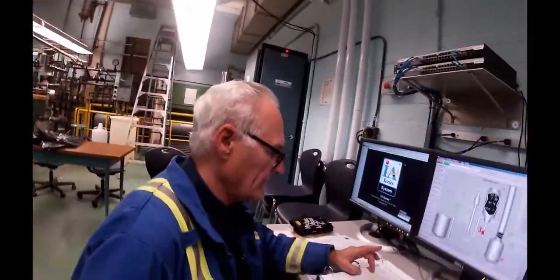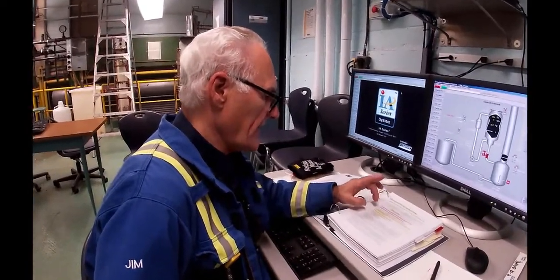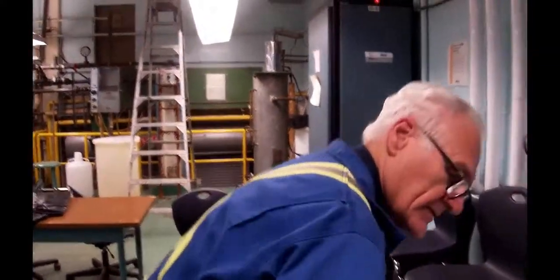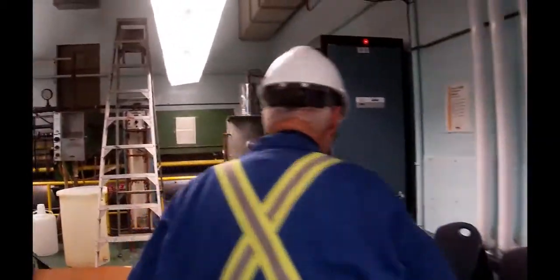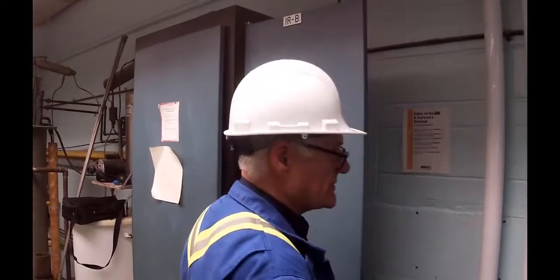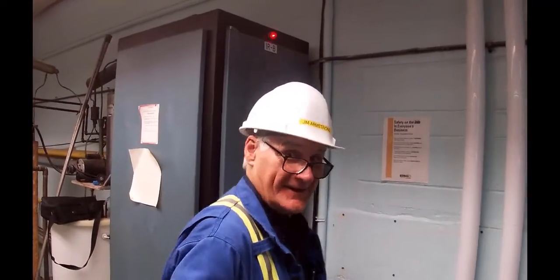We haven't buttoned it down yet. We've got our moisture analysis done. We did the titration. We got the fans on. You need to turn on a 24-volt power supply and some disconnects. So over here, the light is already on. We have a 24-volt power supply right here, which is energizing all the relays that we're going to bring in for contactors for starting and stopping stuff. We have that independent so that it doesn't accidentally start itself up when we're not here. So we turn the power on. Now we need to go get the disconnects.